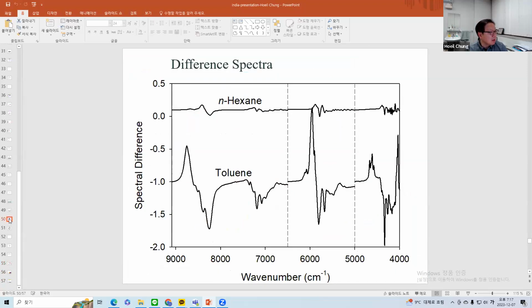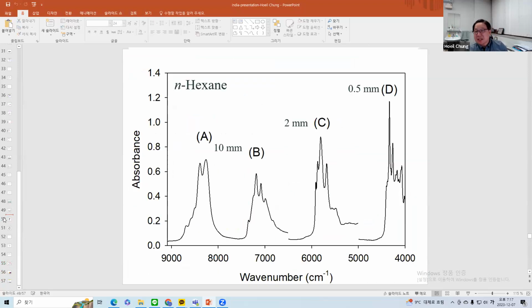Please remember, one thing I want to focus on is that you might have a choice to use a different region of the spectrum, but think about your application. If your application is very simple, forget about the resolution. But if your application is dealing with a complex sample, you have to think about the spectral resolution, which range you want to use, the signal to noise ratio, or your instrumentation. If you consider those parameters carefully, finally, you will have a very accurate NIR analysis.